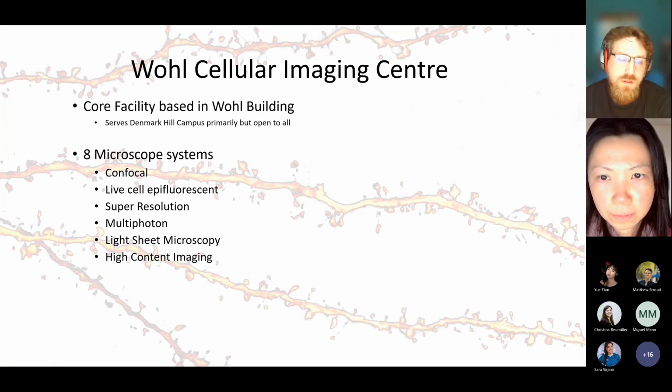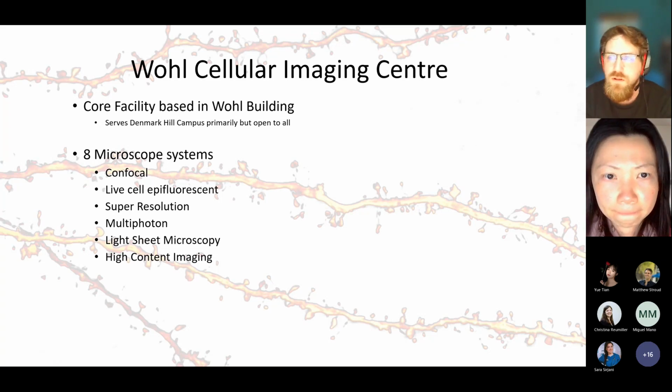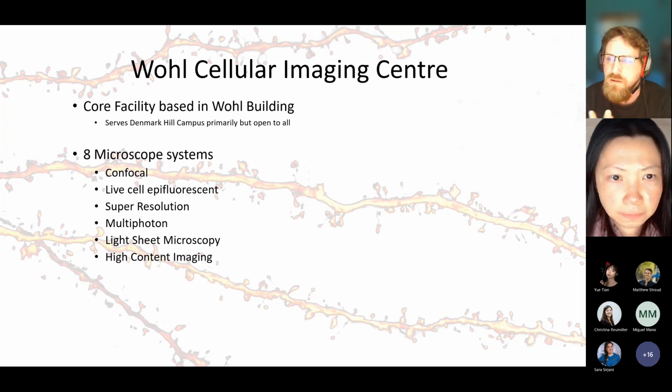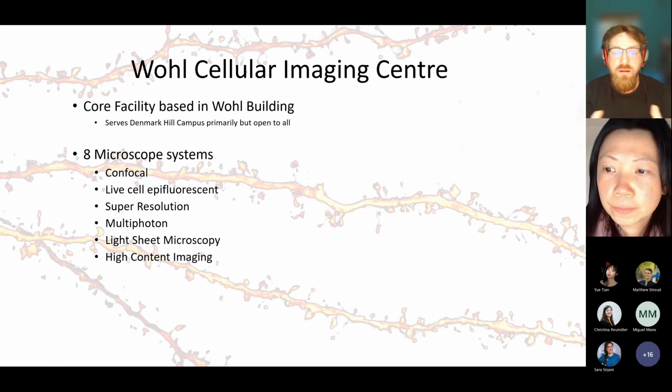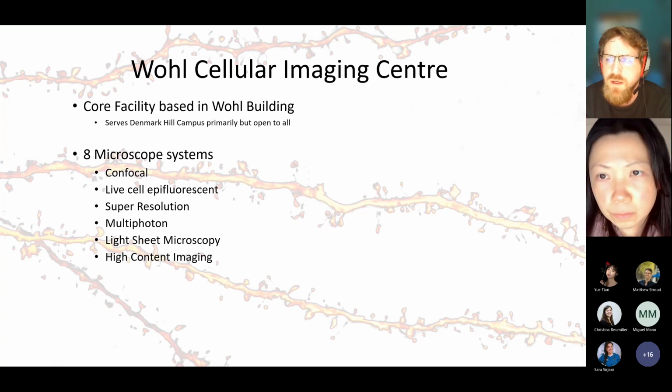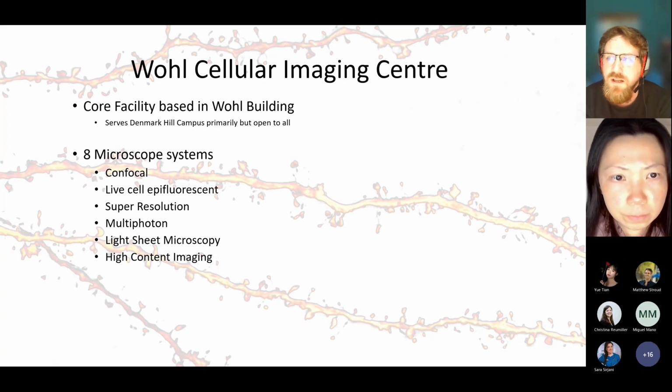And as part of the facility, we also have a storage solution for shuttling data around, which has a pretty high speed connection. So typical data sets where you've done a fair bit, you'd be able to upload in about 5 minutes to our storage solution, and then pull down to the workstation if you were going to do the analysis there. But I wouldn't say it's prohibitively big. It's usually the light sheet data, actually.